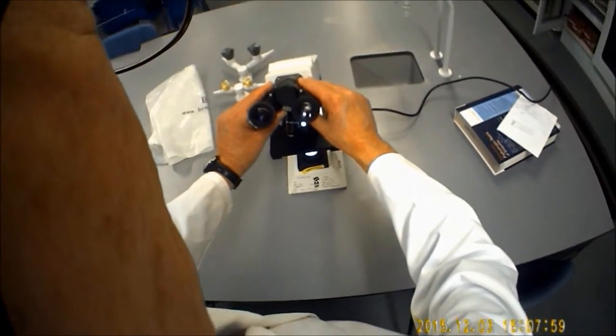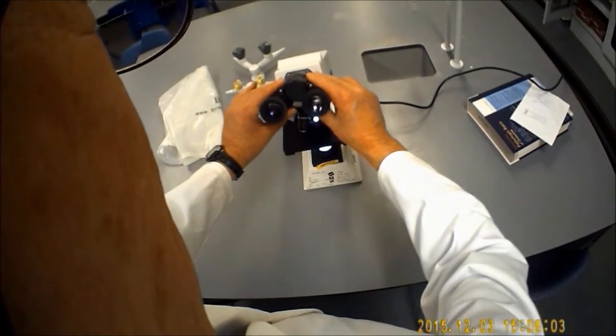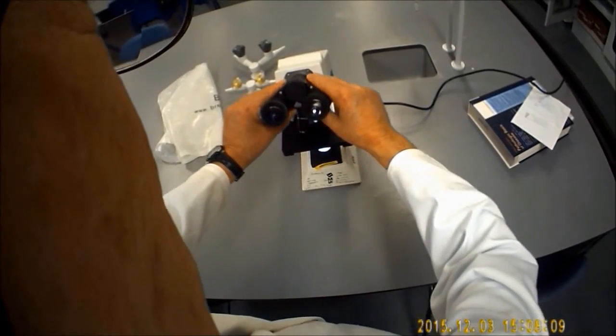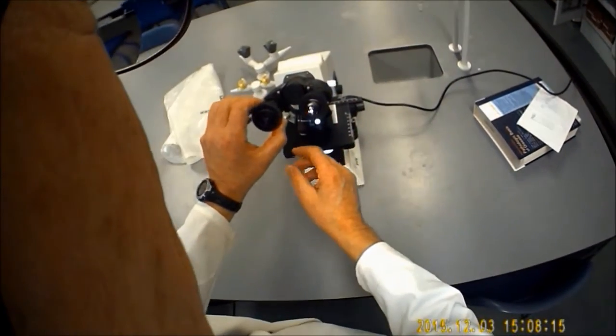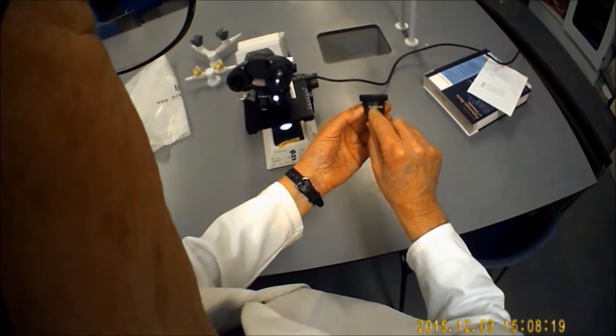You've got two eyepieces here. These are binocular microscopes. You can move the distance of the eyepieces closer and further away from each other to suit your own eyes. The eyepieces themselves are times 10 magnification.